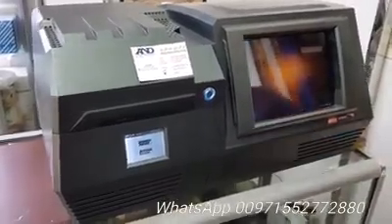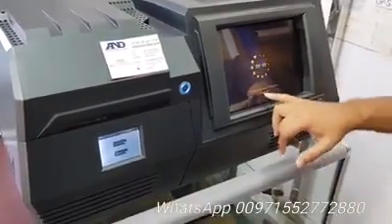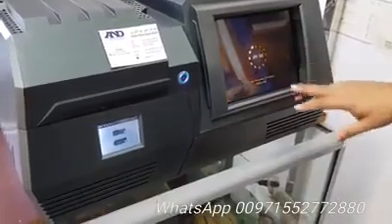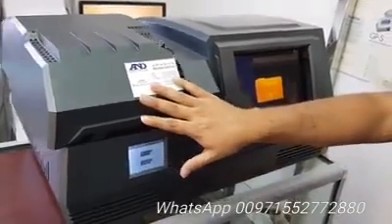We just open the software. After opening the software it asks for a 10-minute warm-up, as you can see. But we will skip this part because we are just making a video — we don't want to bore you.